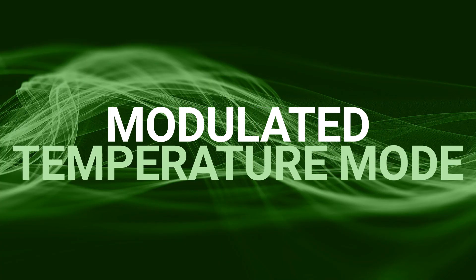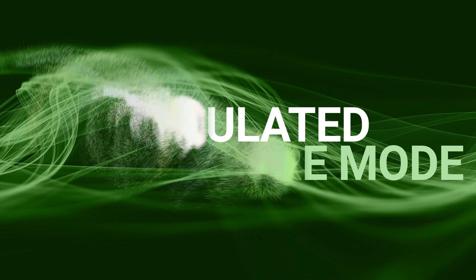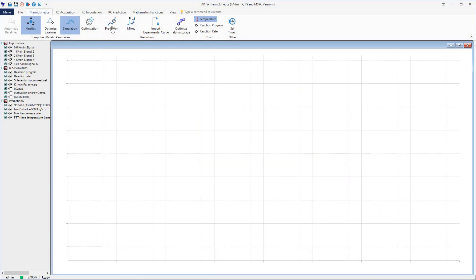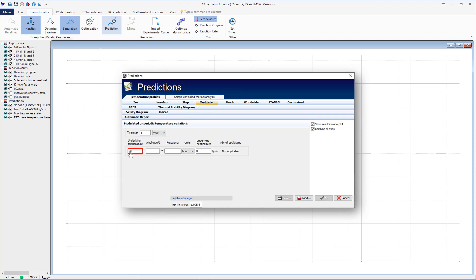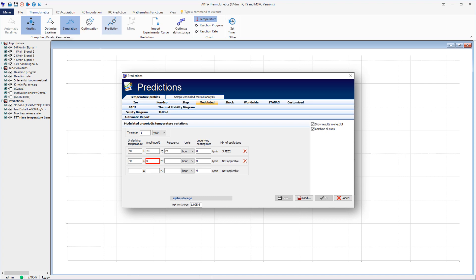Predictions at Modulated Temperature Profiles. Click on the Modulated tab to display the simulation of the reaction rate and reaction progress at a customized modulated temperature. In this example, the underlying isothermal temperature of 40 degrees Celsius is superimposed by periodic waveform oscillations with an amplitude of 20 degrees Celsius and a frequency of 24 hours.